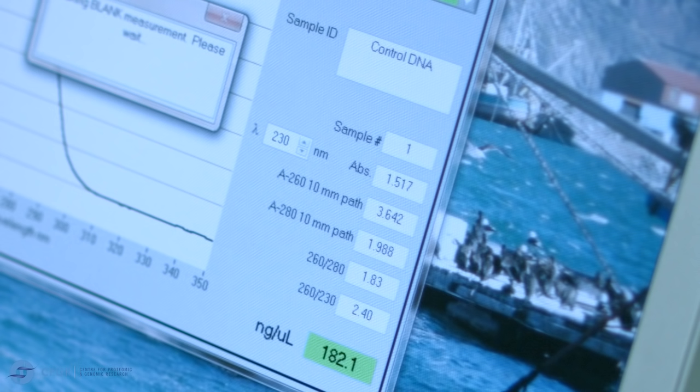Approximate drying times can be found in the DNA stable protocol. However, the drying time should be monitored and the final time recorded. The PCR hood or laminar flow should be kept running for the duration of the drying down time.